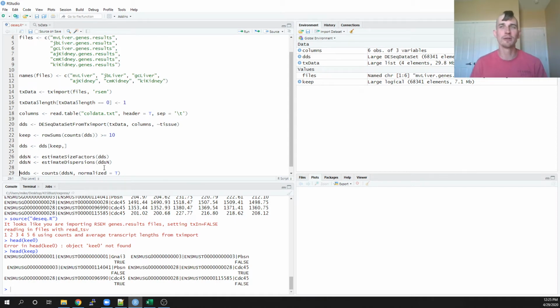But say we actually want to extract a normalized matrix and save and hang on to that. Well, we can normalize our expression data separately from the actual DESeq experiment. These are just built in, things that I know I have to do. I don't exactly know what they're doing.